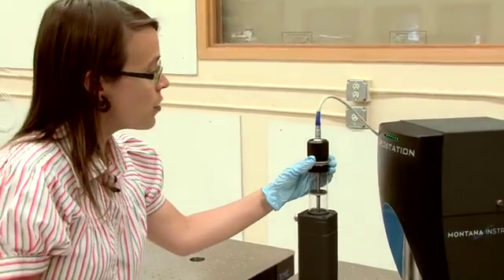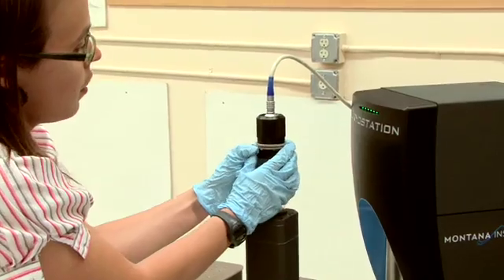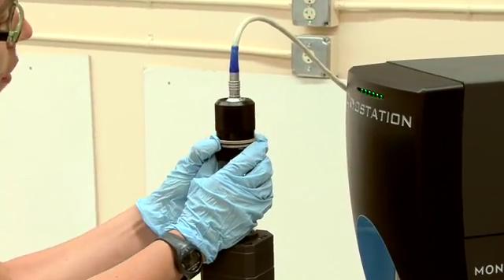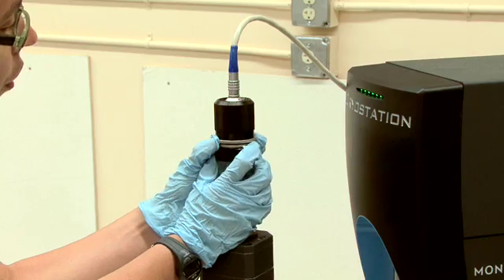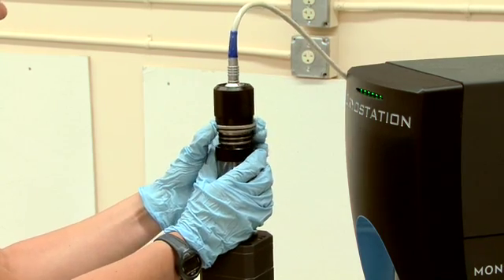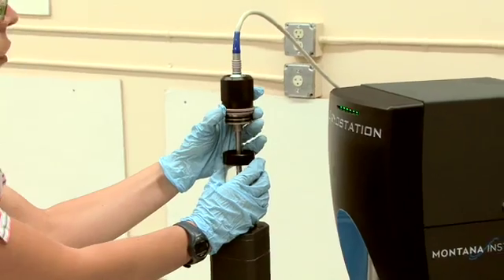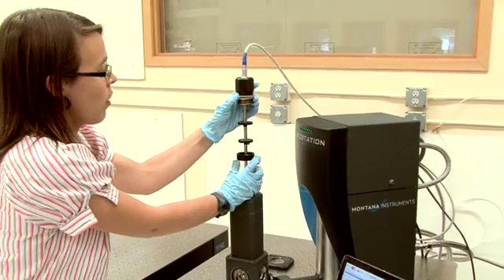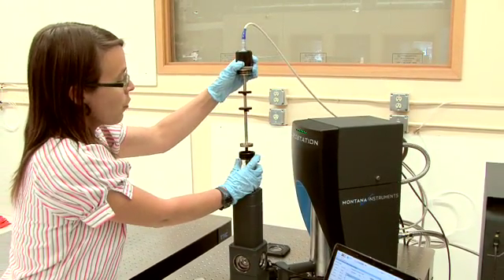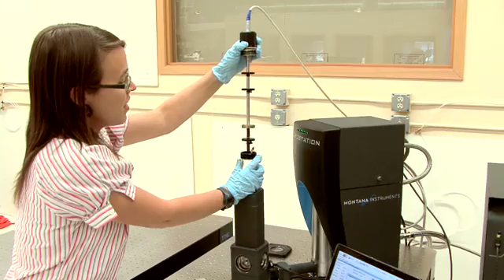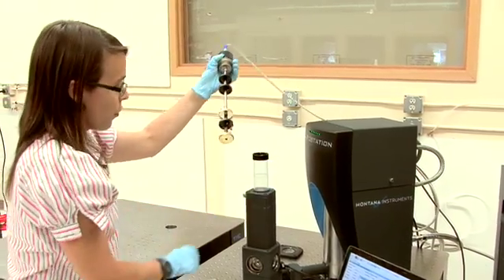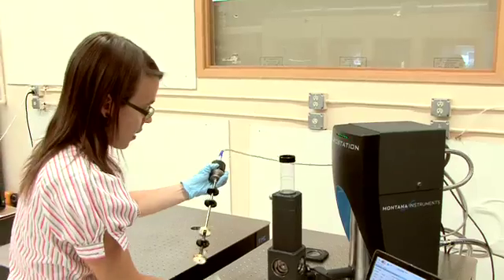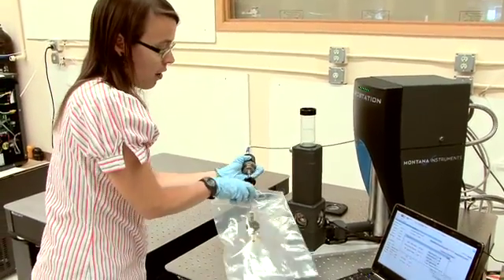To pull the sample rod out loosen the knurled nut and then take the sample rod from below the knurled nut and gently pull out. Slowly remove the rod to reduce the mixing of the air and the helium. Once the sample rod is out water will begin to condense on the rod. To keep the sample rod clean you can insert the sample rod into a bag.